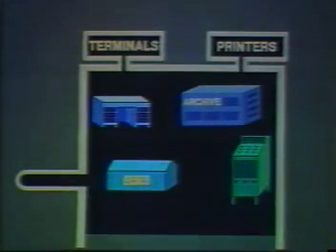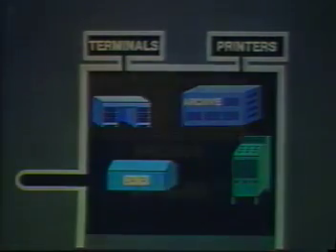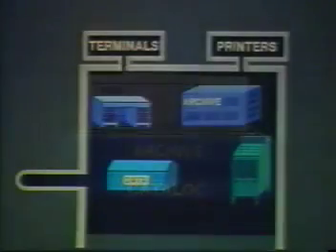Whenever you collect data from an experiment, you may make this data available to other FACS Desk users by placing a copy of the analysis drawer for your experiment into the archive. Conversely, you or any FACS Desk user can use the archive catalog to look up and retrieve primary data from any experiment that has ever been archived on your FACS Desk system.